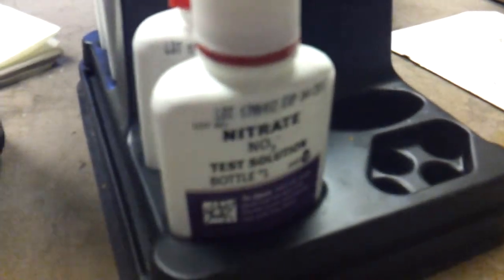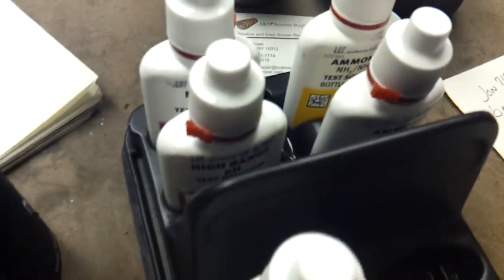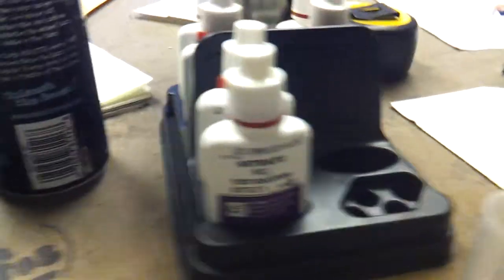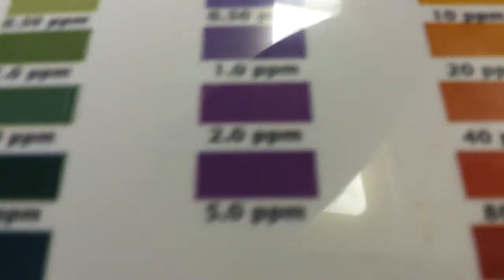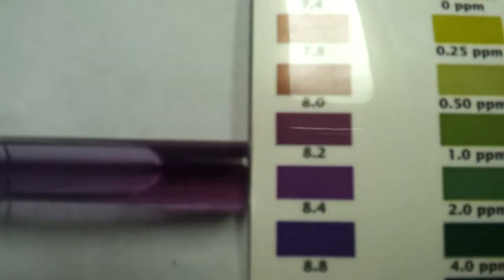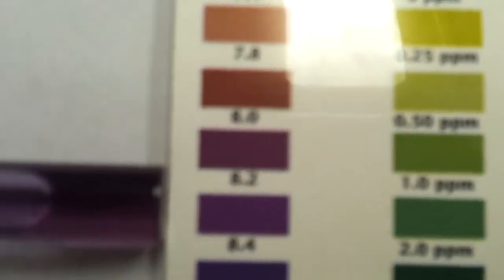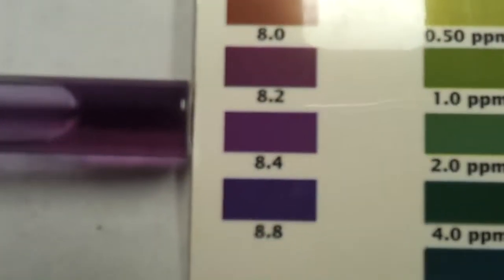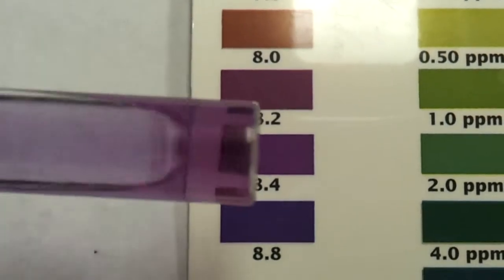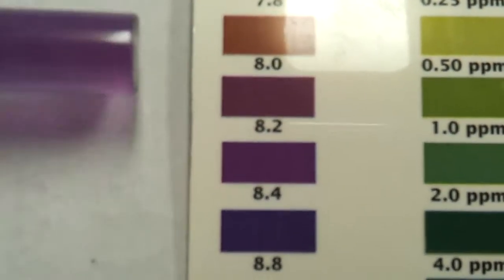I just wanted to show a quick test of my local fish store's water using an API test kit. I had taken in one of their samples and this is what I got for results. As you can see, their pH is right on the money — about 8.2, a little bit higher. Let me zoom in and get a focus on here. There we go — between 8.2 and 8.4 for their pH.